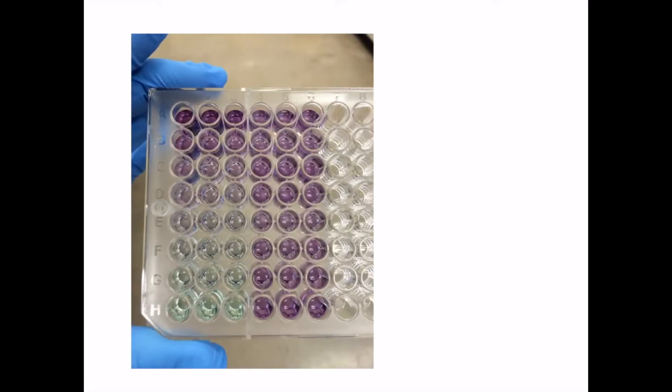In this video, we'll be overviewing the BCA assay, which is a technique that lets you know how much protein is in your sample.